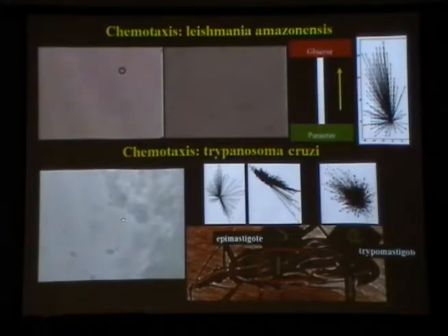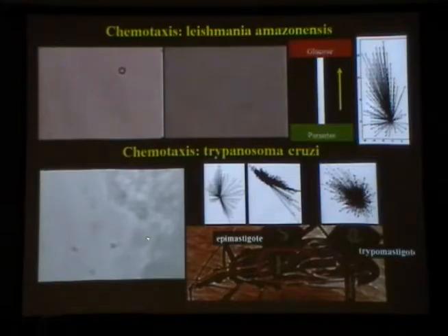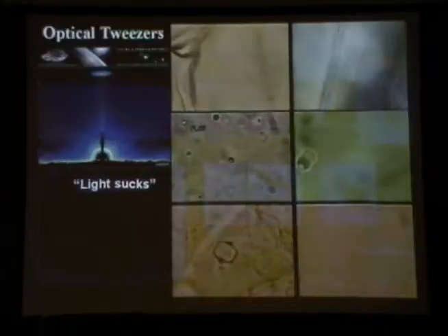And it's the same, because if you look at the tail, it tries to bind the tail at the wall. So the movement is kind of strange. It's not directed toward the wall, but it's trying to, because it always binds with the tail here and not with the head.